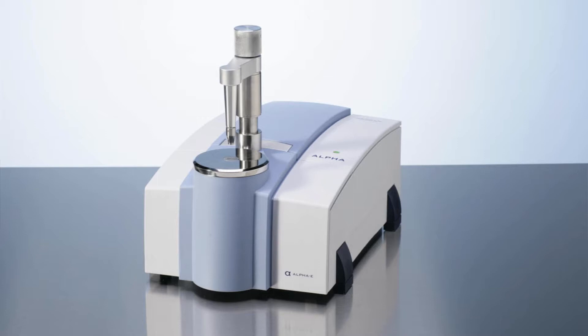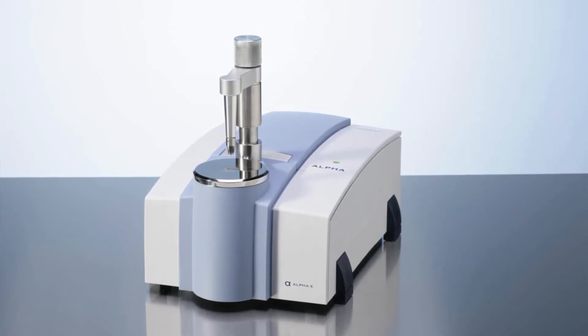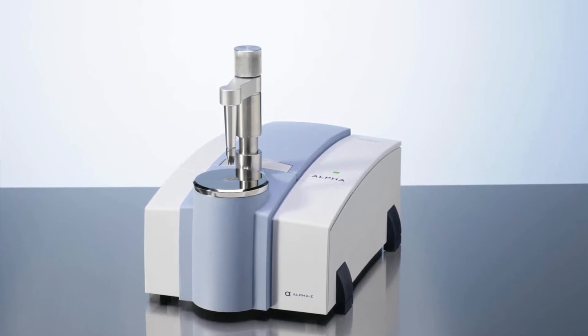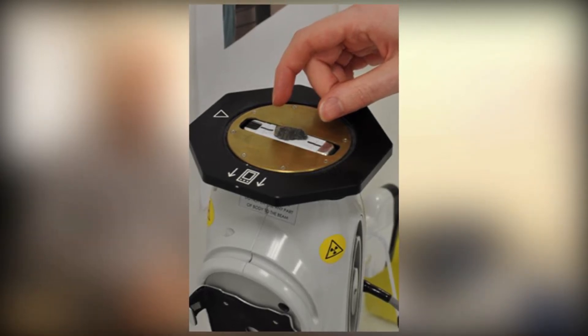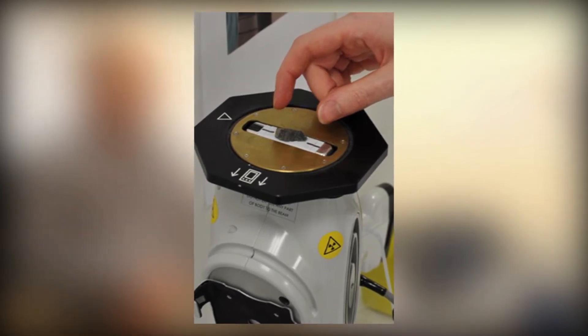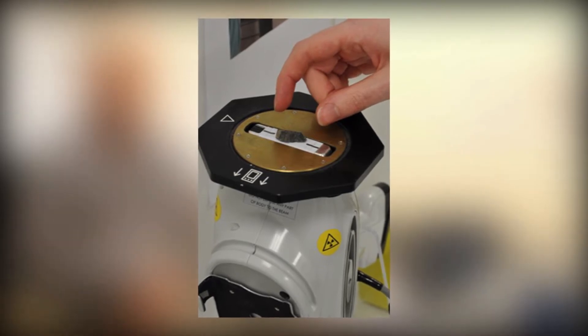Here we have two instruments. This is a mid-infrared spectrometer which we use to analyze soils for multiple soil properties in one pass, as well as plant nitrogen and the quality of many agricultural products. We also have a portable x-ray fluorescence spectrometer which we can use to analyze macro and micronutrients in plants in one pass, and also heavy metals in soil and plant materials.